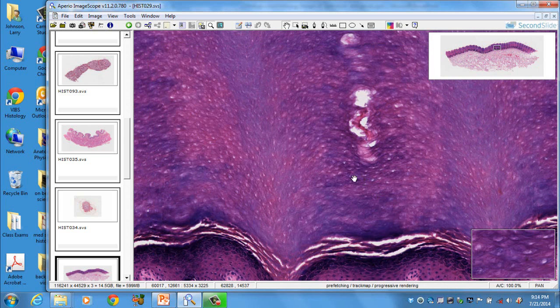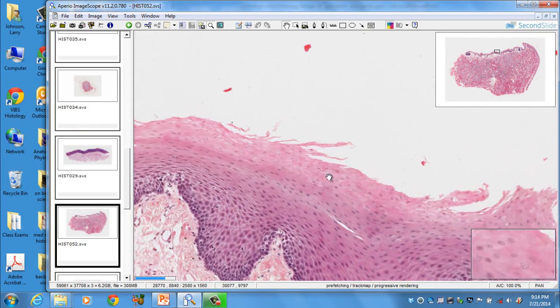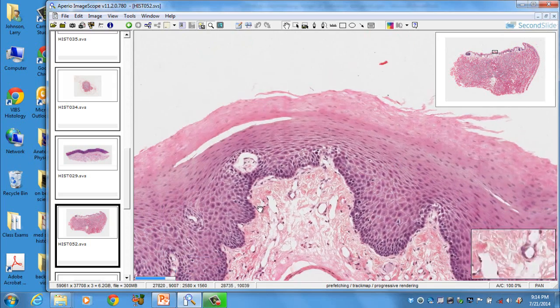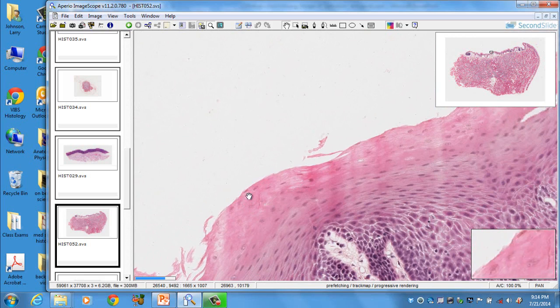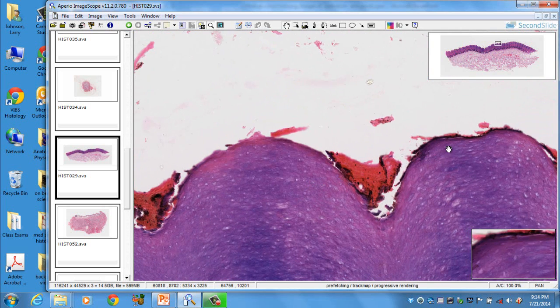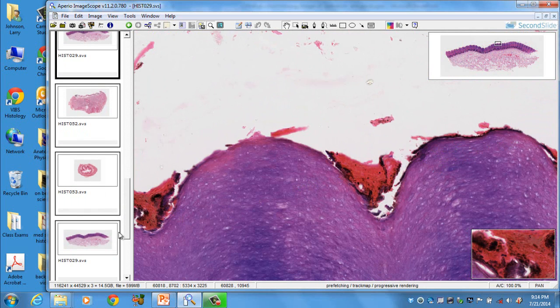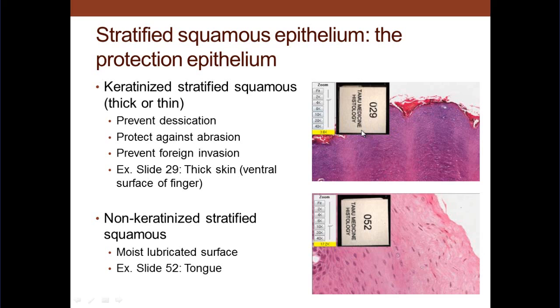Is keratinized epithelium there. In contrast to here, in the tongue and the oral cavity, we see kind of flattened cells on the surface, stratified squamous, more than one layer of cells, as you see, but they're not hardened on the surface, as you saw in the previous one. So you see live cells sitting up here at the surface, where these cells are dead, denucleated. Just the matrix is what's inside those cells at the very end. And so we see that again, keratinized dead cells on the surface. Non-keratinized, you have live cells on the surface, just sloughing off at the top.